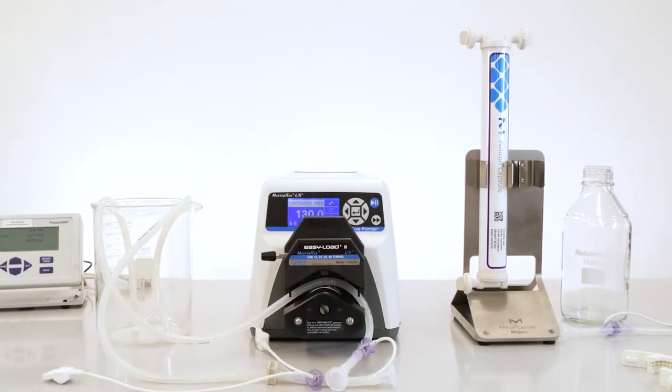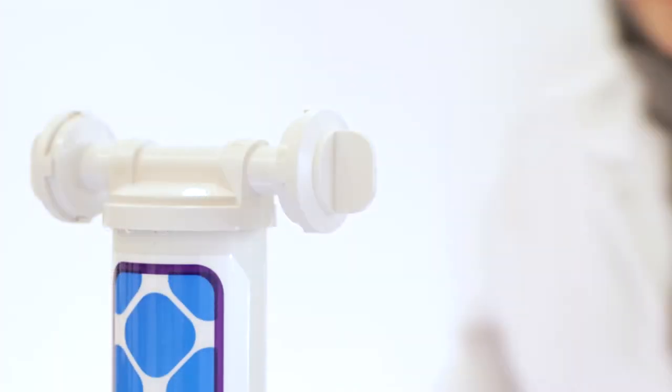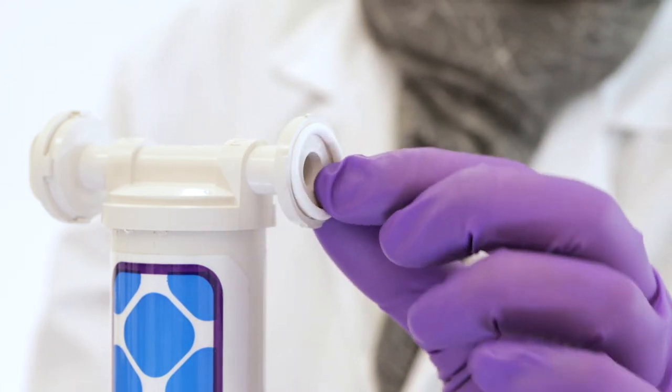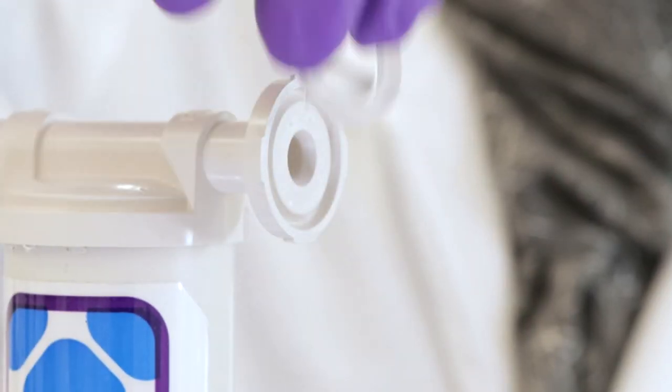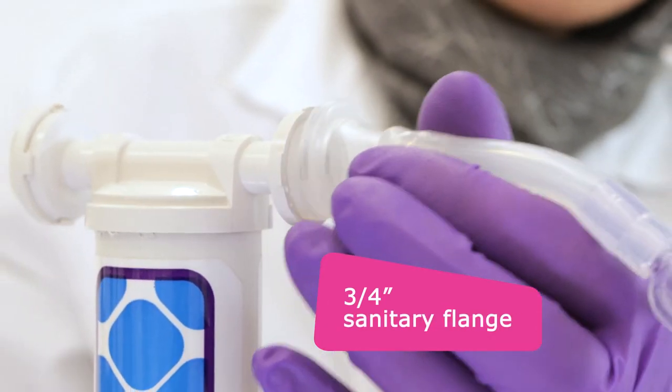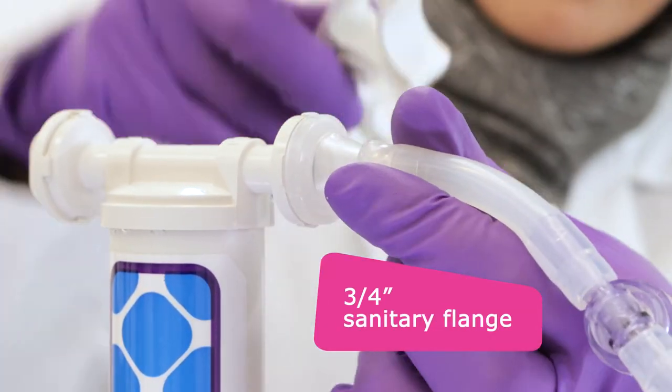To integrate the capsule in your TFF system, first remove the permeate port cap by twisting it off and make sure the O-ring is removed. Place a sanitary gasket at the port and use a three-quarter inch sanitary fitting and clamp to connect the permeate line.